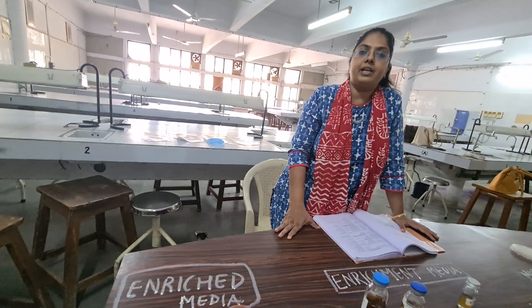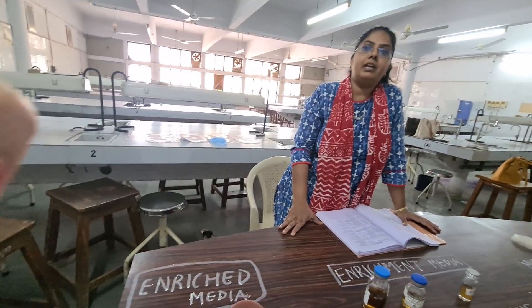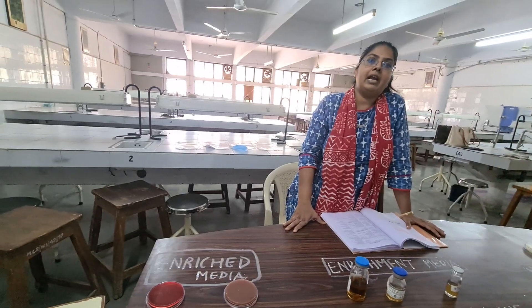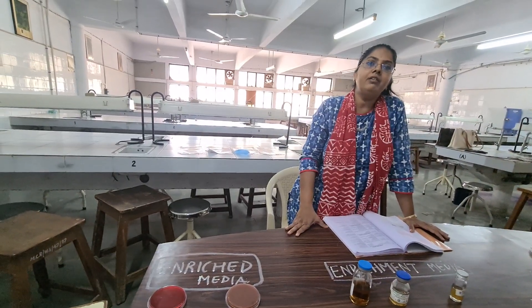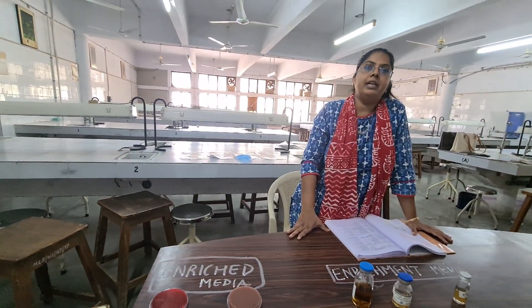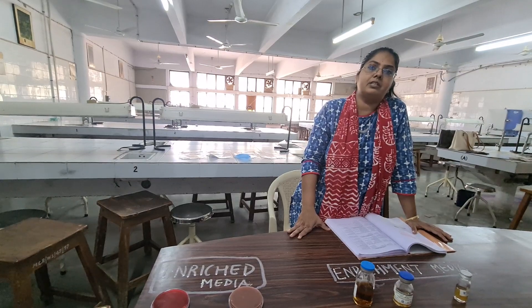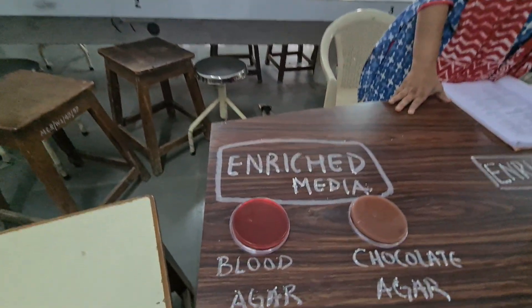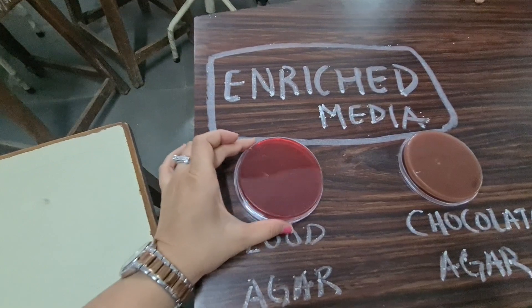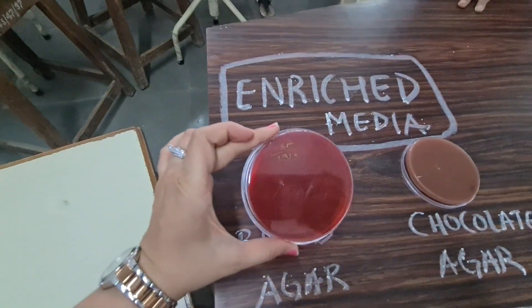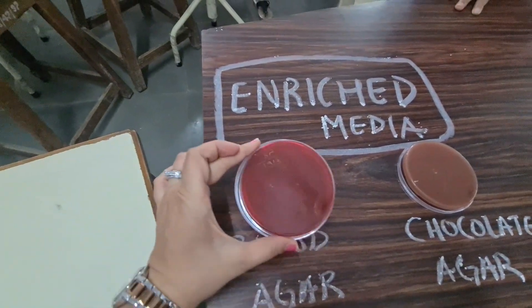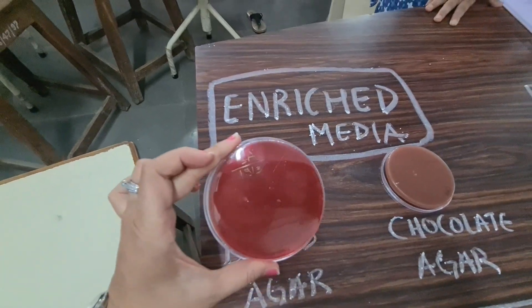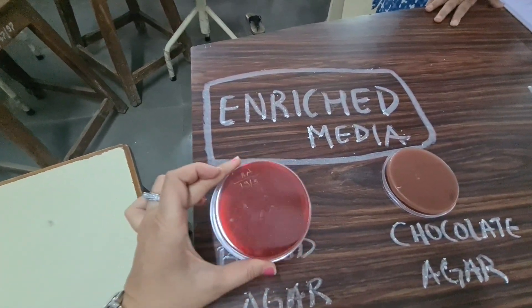Now, enriched media. Enriched media contains blood, egg, hydrocoel fluid, and serum in addition to basic substances. Enriched media is used for the growth of fastidious microorganisms. This is a blood agar plate, where the enriching substance is blood.